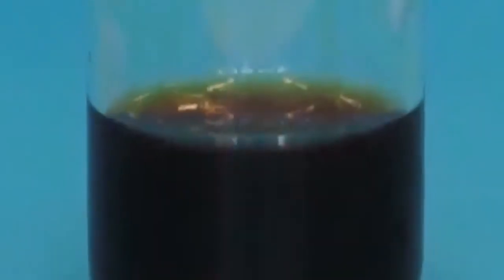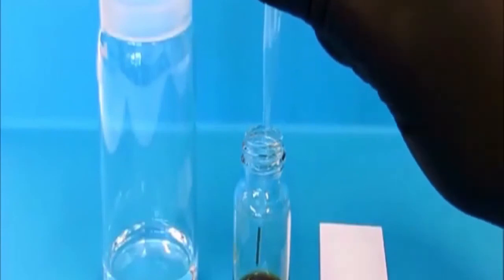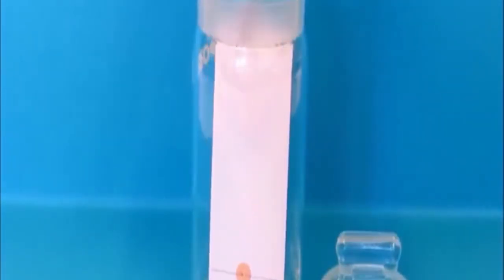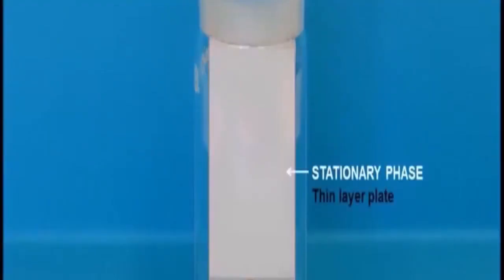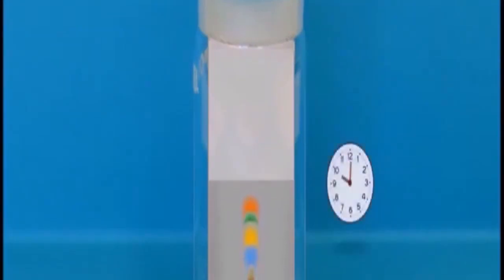In the TLC technique, first we spot the mixture on the starting line on the TLC plate. Then we put the TLC plate in the jar containing the mobile phase and cover it with a lid. We can see that the mobile phase is moving upwards through the stationary phase particles due to the action of capillary, as there are tiny spaces between the particles of the stationary phase. We can see that the major components of the mixture are separated and form several different spots due to different travel distances in the stationary phase.